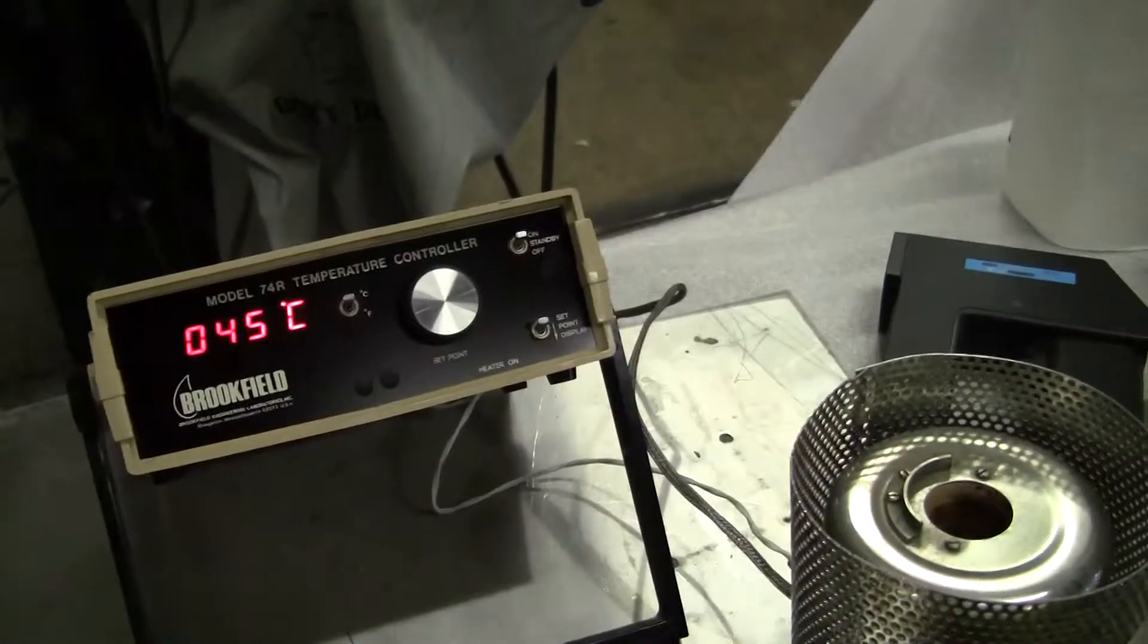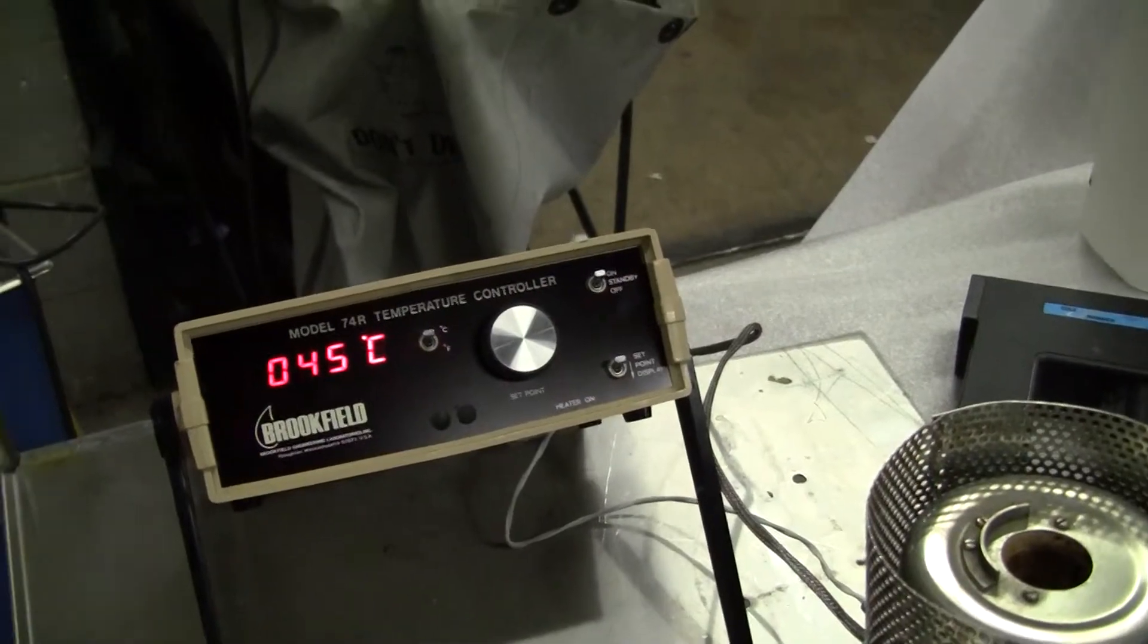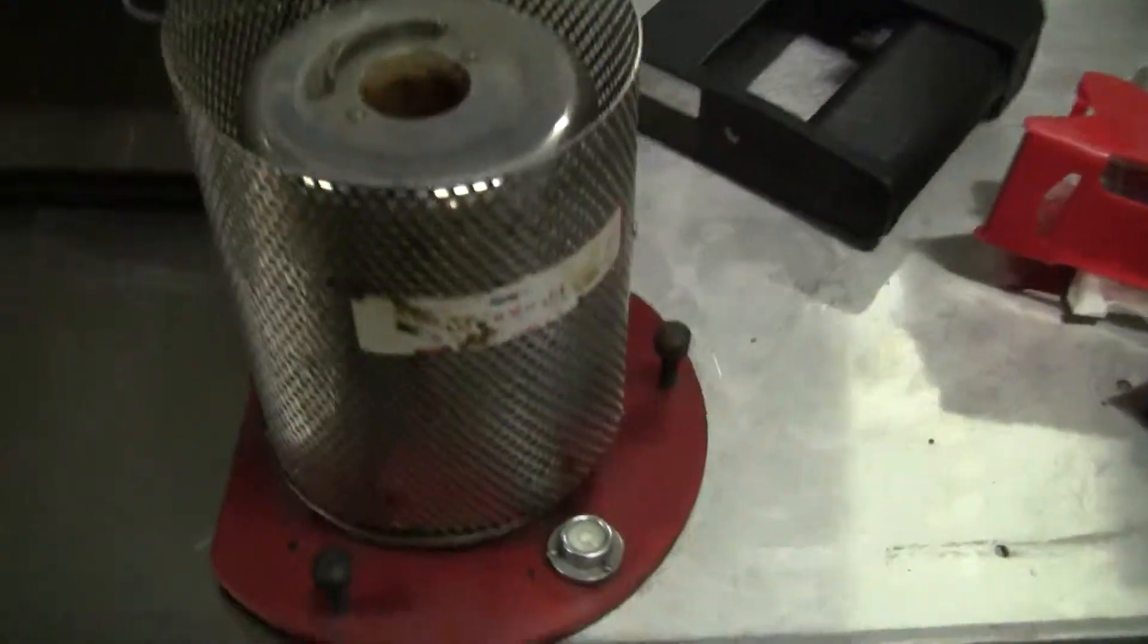Hi, this is Michael Natal from HitechTrader. Today we're looking at the Brookfield Model 74R temperature controller hooked up to the heater unit.